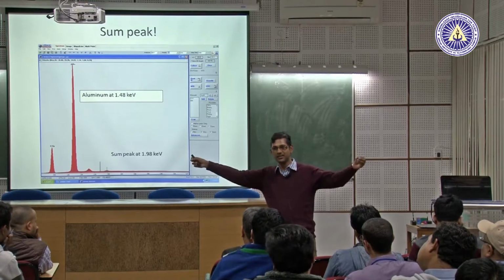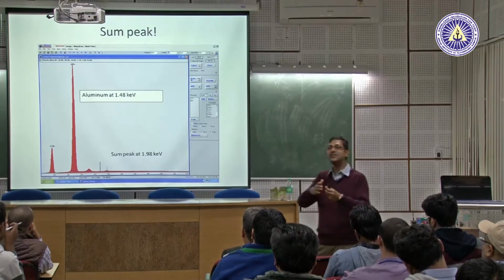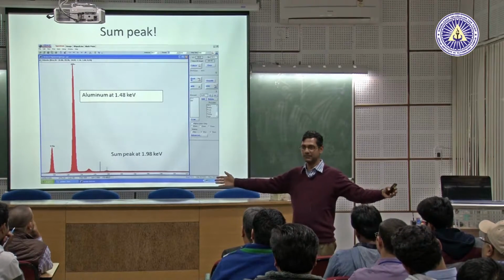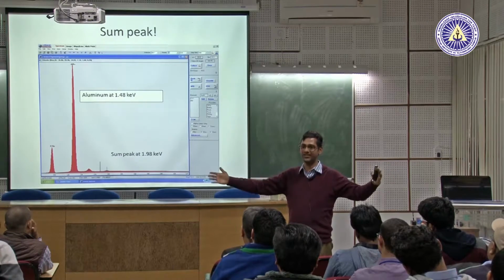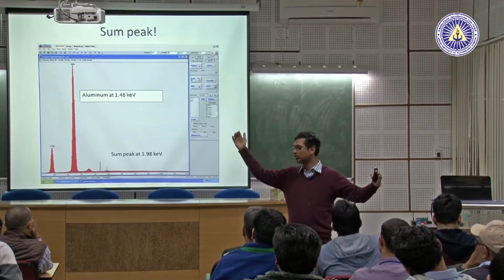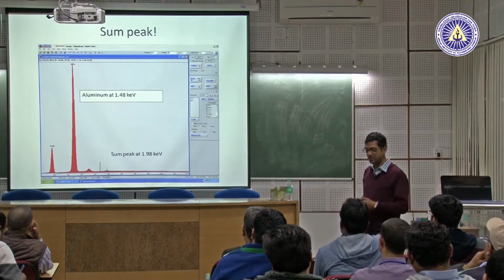The filters are made electronically. And that means what? Energy is dispersed. The electrons, X-ray beams or X-rays generated are dispersed energy-wise from 0 to 20 kilo electron volts. That's why it's called energy dispersive spectroscopy.